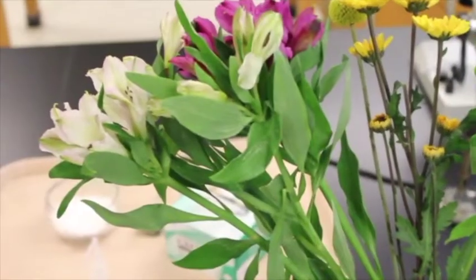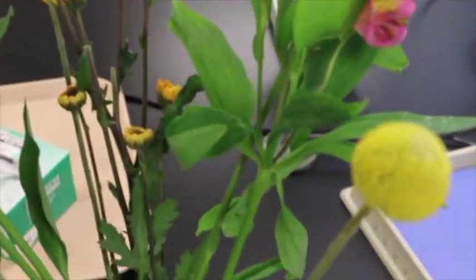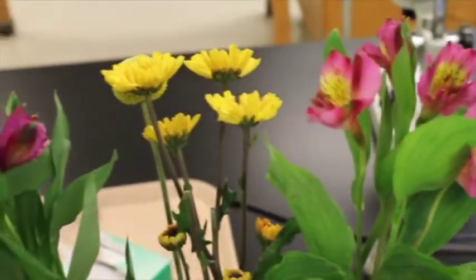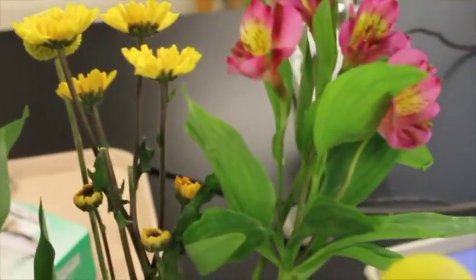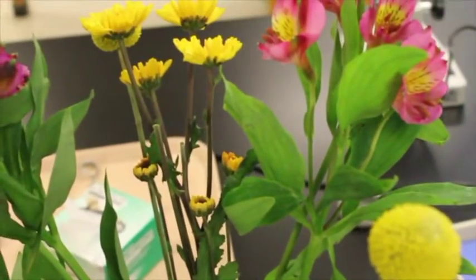And a big key feature of flowering plants, of course, are the flowers themselves. So in class we have a variety of flowers. We have Crespedia here, we have Ostromeria here, and we have mums here. I'm actually going to dissect one of each of these and get this on video for you guys so you can kind of look it over and check it out.